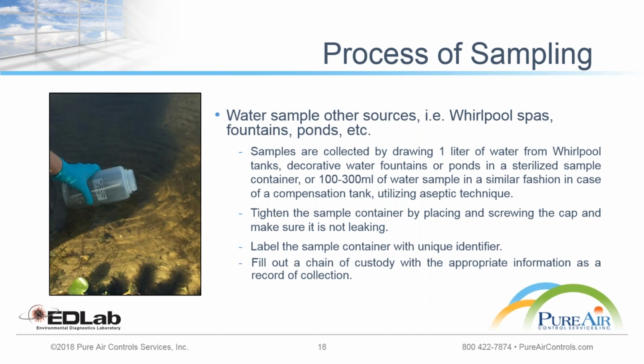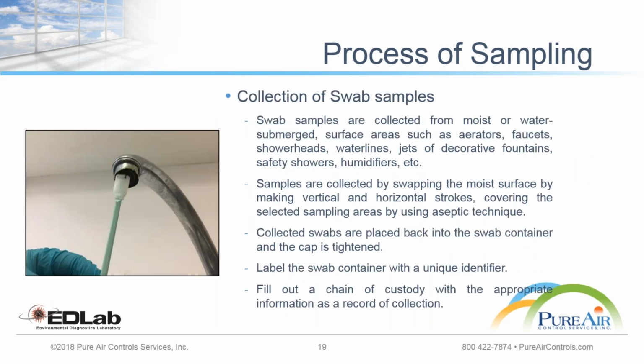The other method of sample collection is the swab, which we can use to collect the sample. This kind of method is used in collecting the sample from the faucets or shower head, etc.